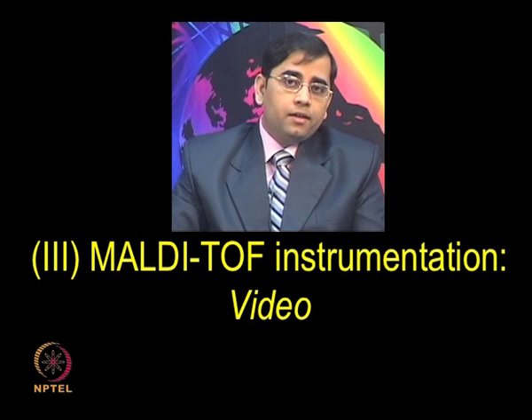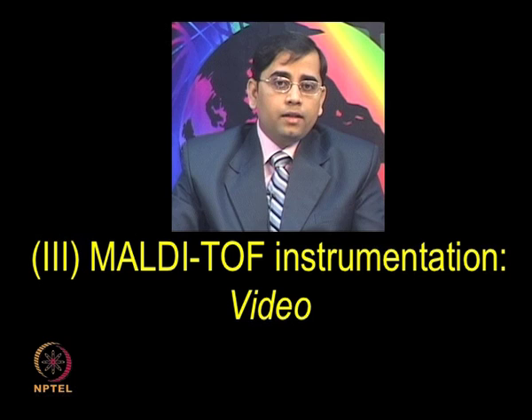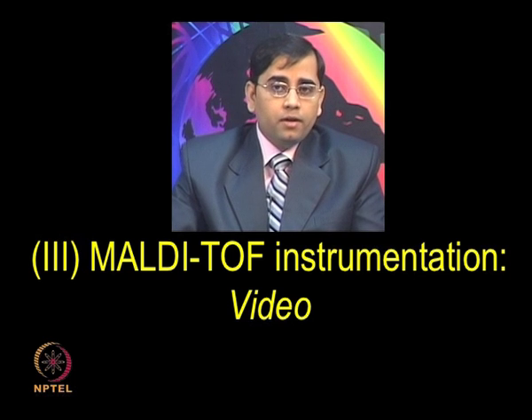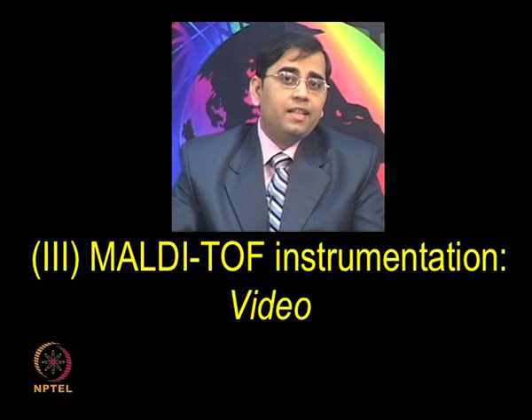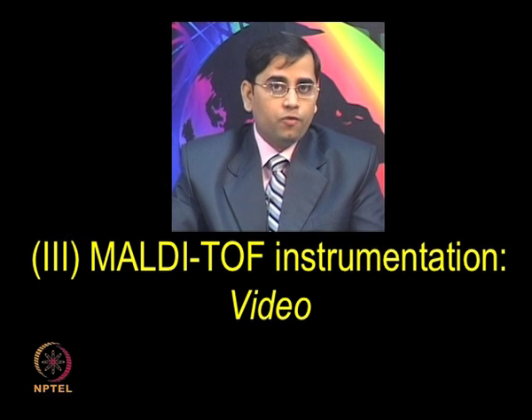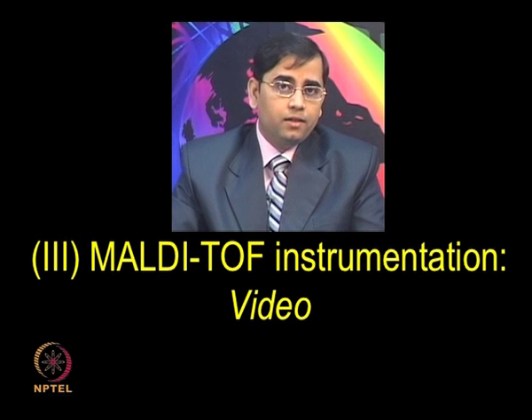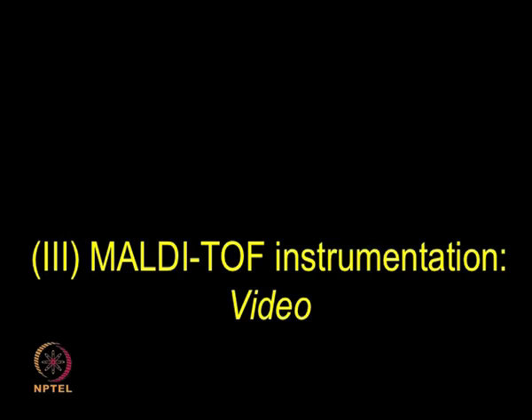Once spotting is done, the MALDI plate is dried for almost 30 minutes. Then the instrument can be turned on and MS analysis can be performed. Now, there are various types of configuration of these instruments available, as well as various types of commercial software which help to operate the hardware. It is not possible to go into individual detail, but I am going to show you the generic steps in the following video of MALDI-TOF instrumentation.